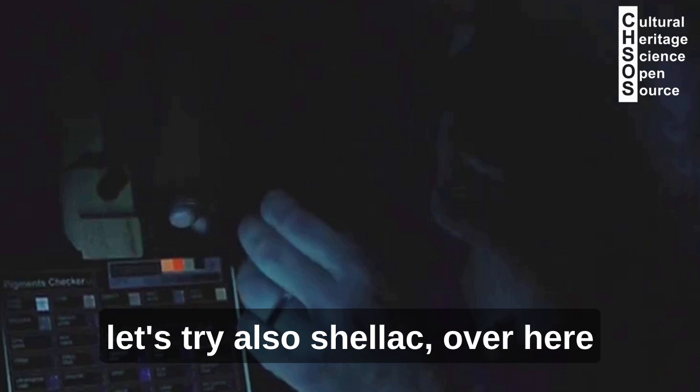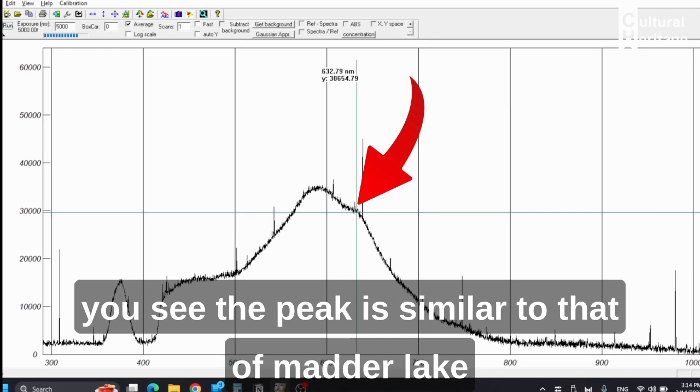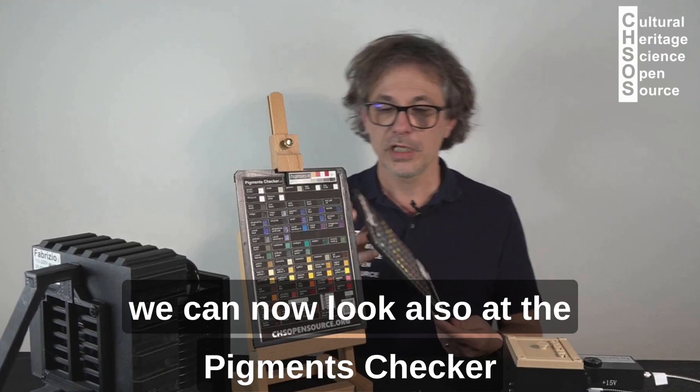Let's try also the Shellac over here in the calibration card. We are doing five seconds. You see, the peak is similar to that of Madder Lake, but now has another maximum towards 630 nanometers.